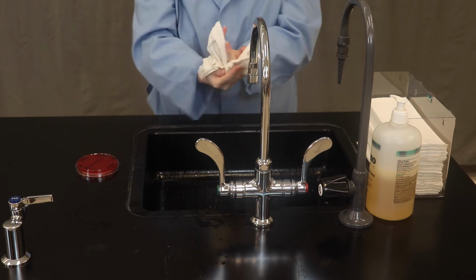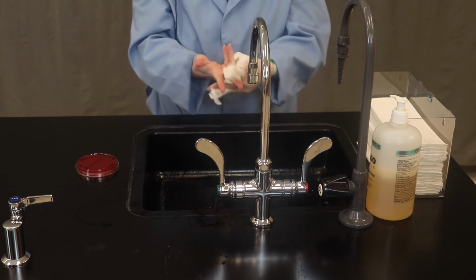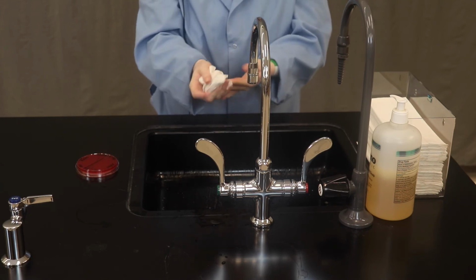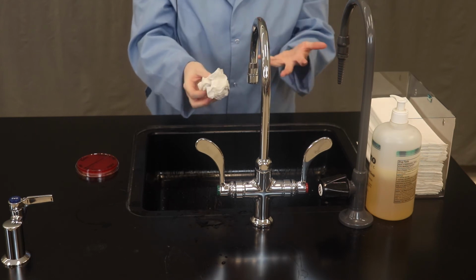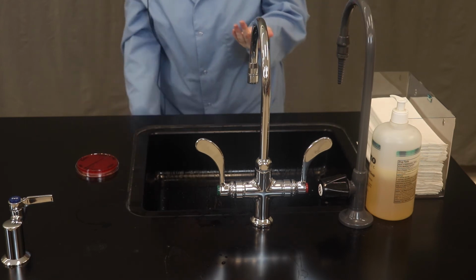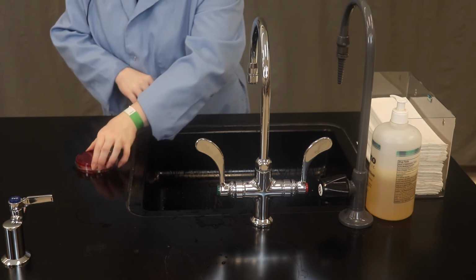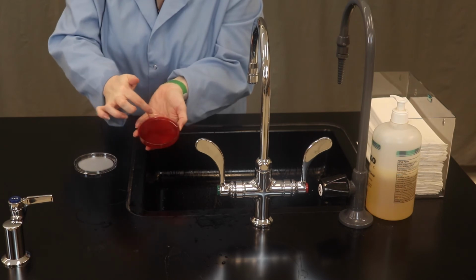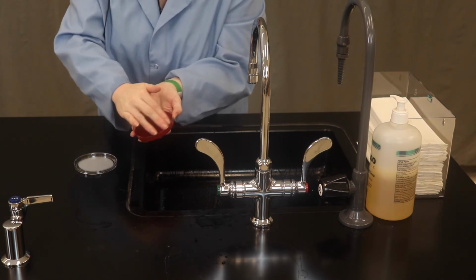I want to make sure my hands are as dry as possible. These paper towels are not soiled with bacterial culture, so we're just going to throw them in the trash. Using those same fingers, I'm going to go back to my Petri plate on the after side. I want to try not to dip back into the before side. And I'm going to rub my fingers again.